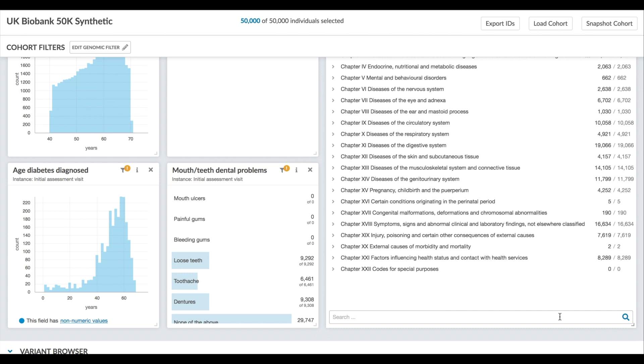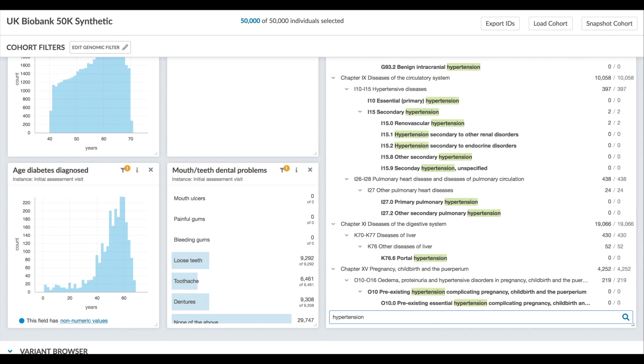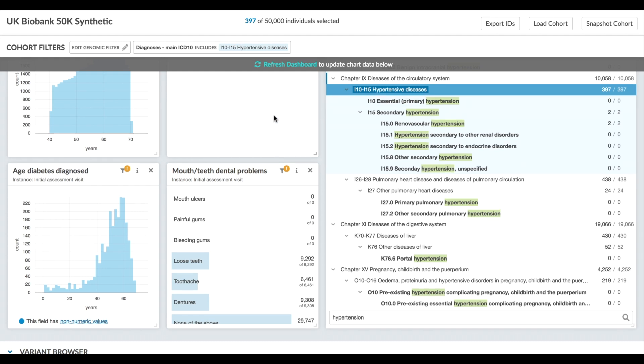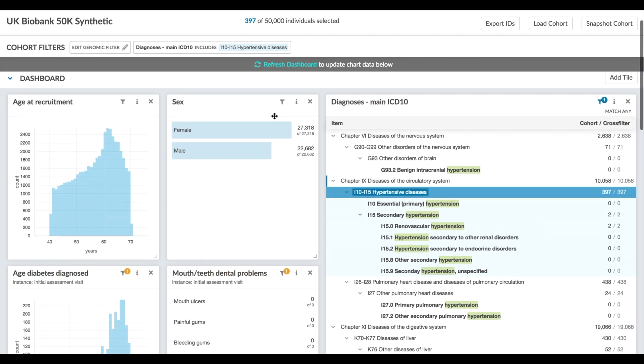Now let's start exploring the data. Let's say I want to build a cohort of individuals with hypertension based on these diagnostic codes. Since the codes are hierarchical I'll choose one of the higher level categories to capture everything under it. This defines a filter to run on the underlying database.